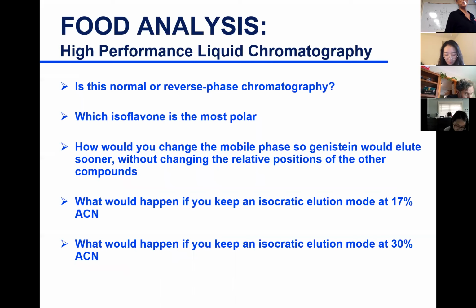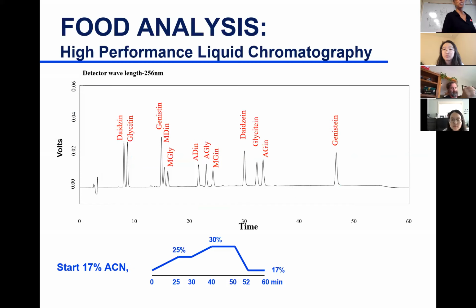Is this normal or reversed phase? Okay, I already spelled it out. It's reverse phase, but how would you have guessed it was reverse phase? Let me rephrase that question. How would you have determined it was reversed phase? Let's see if anybody other than... from what you're seeing here, how would you determine it's reversed phase? Okay, Steve. Polarity of the starting solution. Yes. Was that what you were saying?